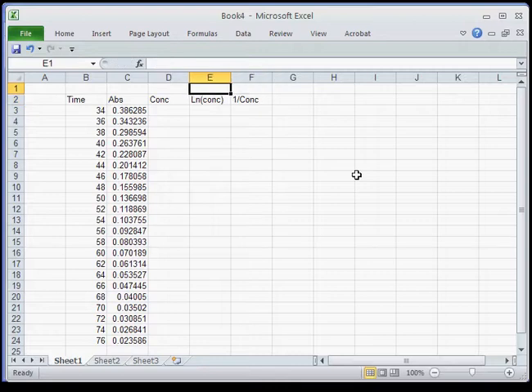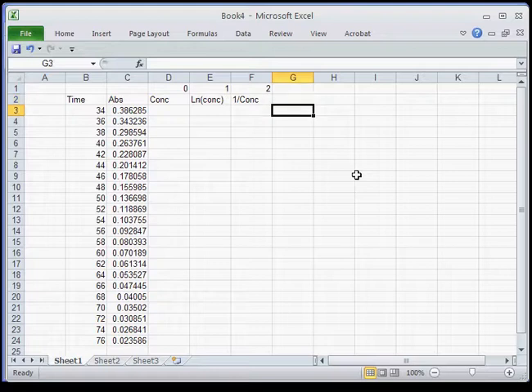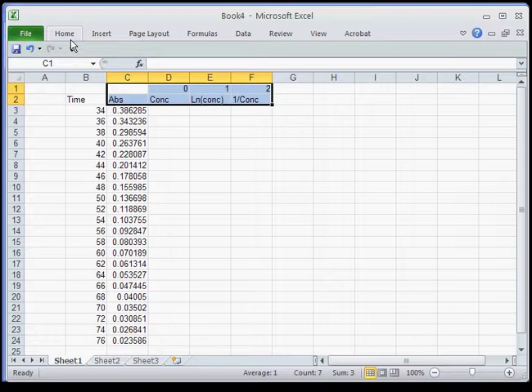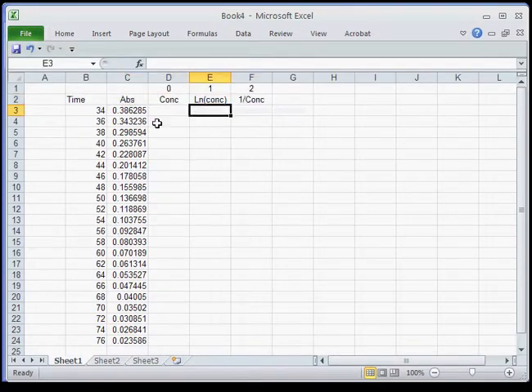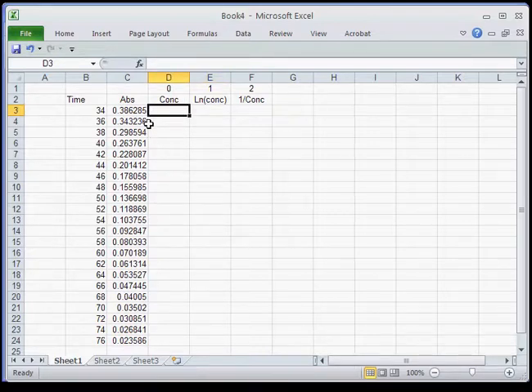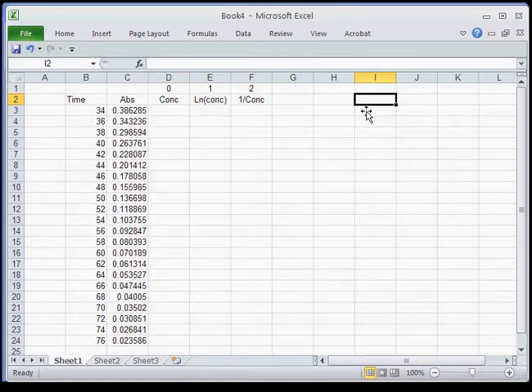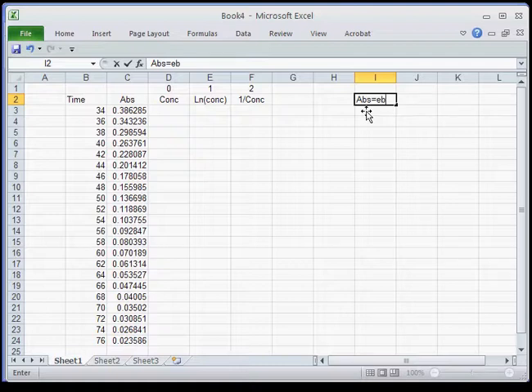The additional headers are: natural log of concentration, and one over concentration. If you remember, this is a zero order plot, a first order plot, and a second order plot — I put those up there to help remind you. Now what we have to do is convert absorbance to concentration.